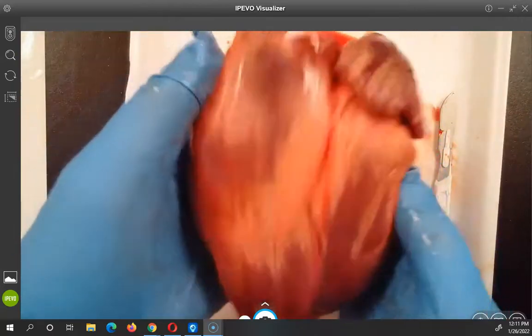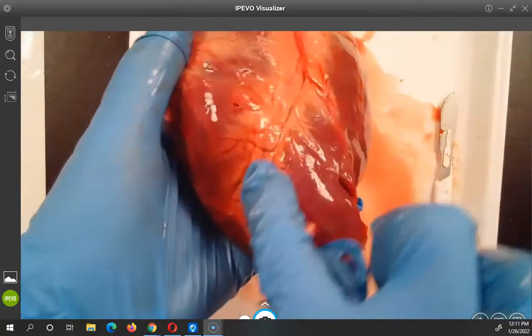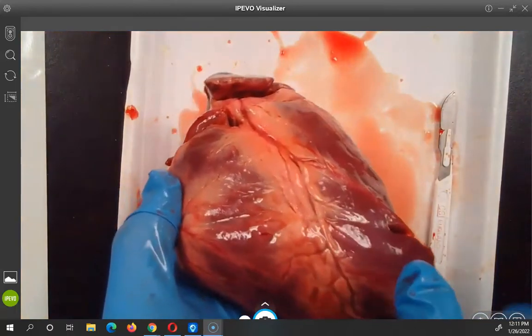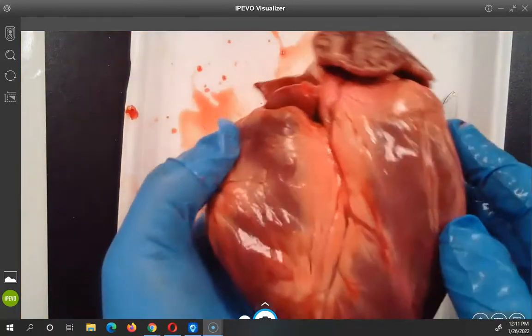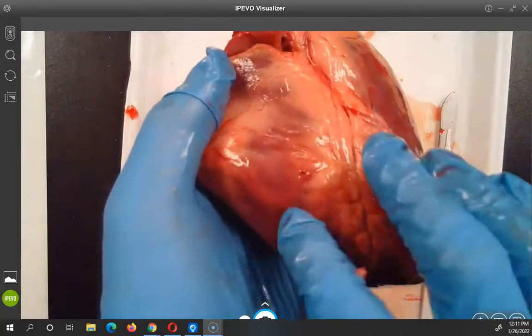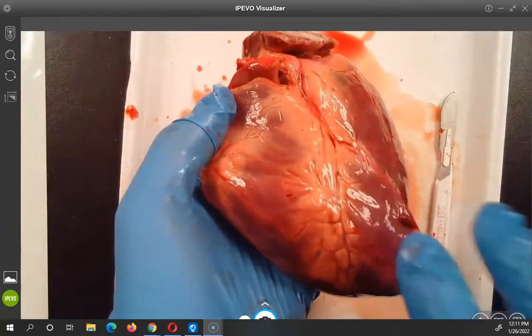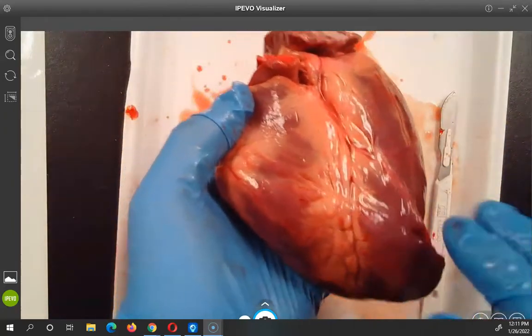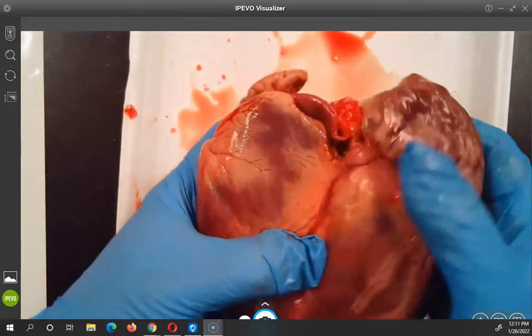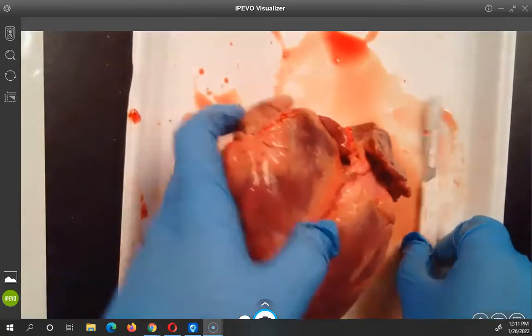On this side you're seeing more veins — look how they branch out, you see those cool branching patterns? This is an example of how we mimic nature. Trees and roots have branching patterns, rivers have branching patterns, and our veins — our circulatory system in our body — has branching patterns.